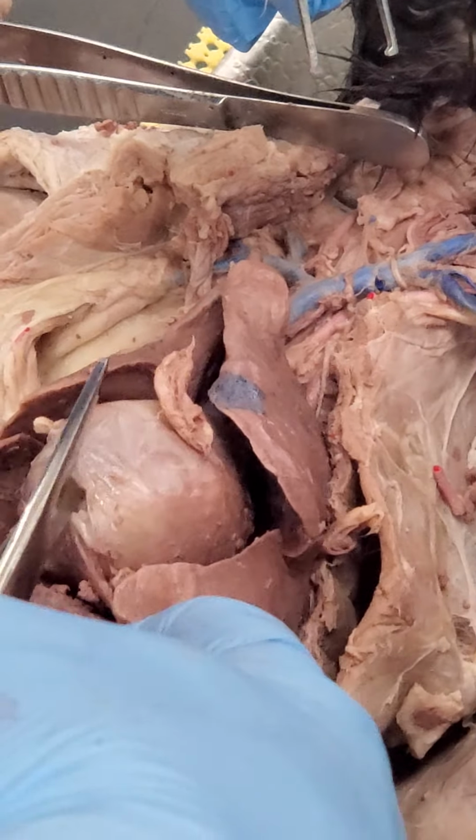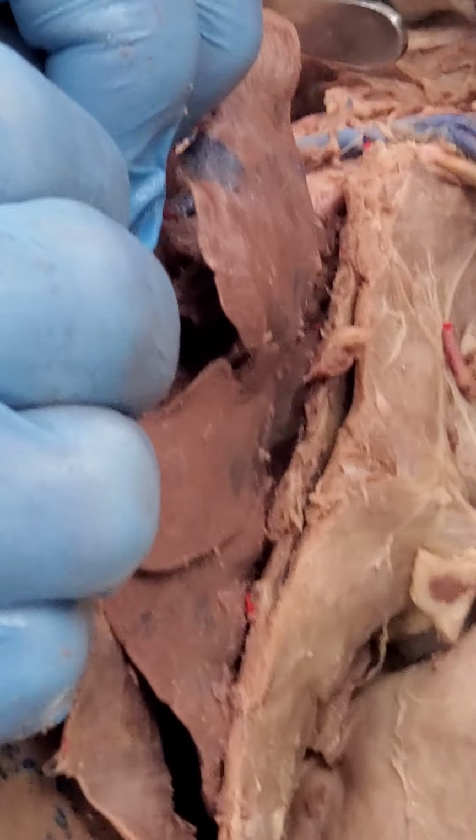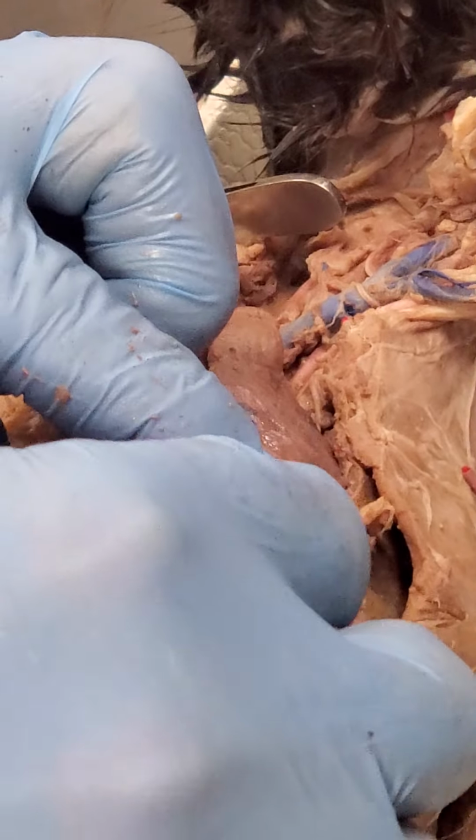But there, that's a pericardial cavity where the serous fluid would be. So I'm cutting the parietal pericardium, and it's really tough. You can take the cat and lift the whole thing up just by the parietal pericardium. Most serous membrane is real delicate. That's thick. So that is the parietal pericardium. I'll put a pin in it and I'm allowed to identify it.